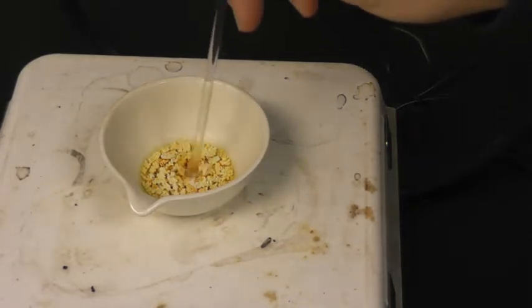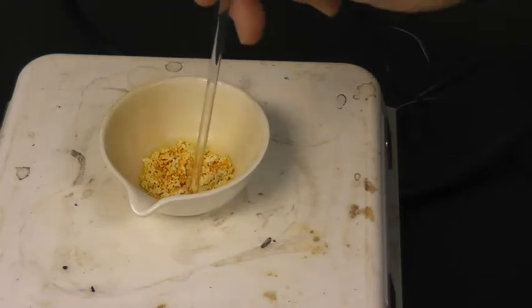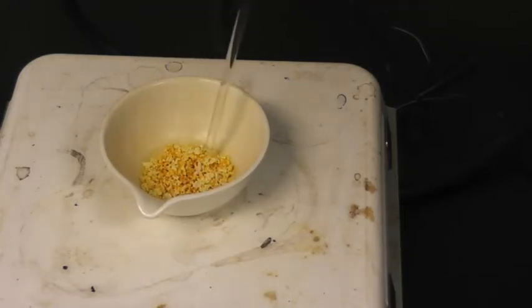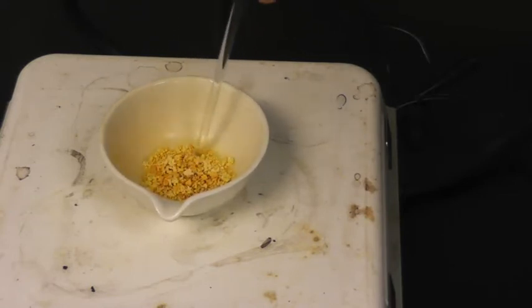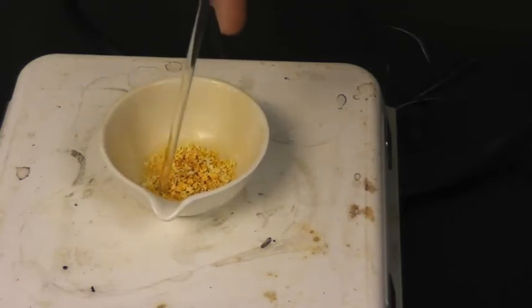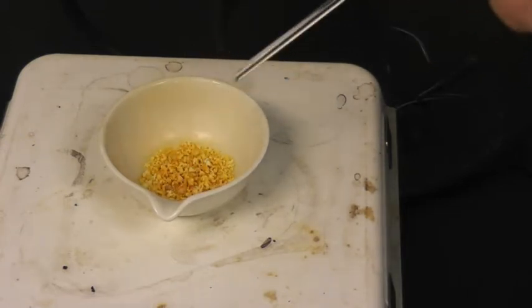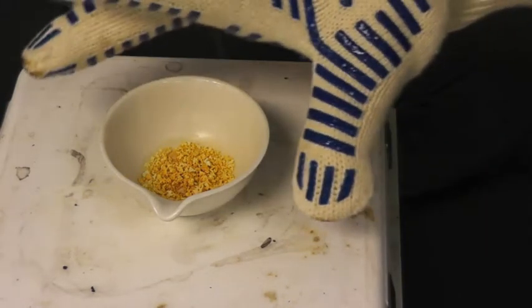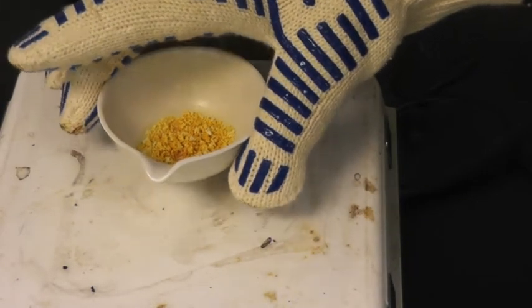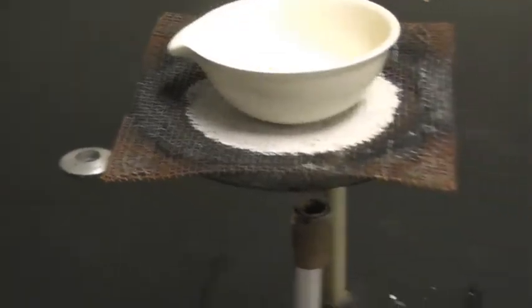So I'm just going to crunch this up a little bit. It's going to turn more red, and if you could see it, maybe right around here, you can see more gas coming out, more of that orangish gas. And I'm just going to break up those big piles of stuff, and those big piles just had a little bit of water in there, probably just gas trapped within the solid. So now what's going to happen is, with a glove, because this thing is crazy hot, I'm going to pick it up, and it's just going to get transferred over here, right up there.